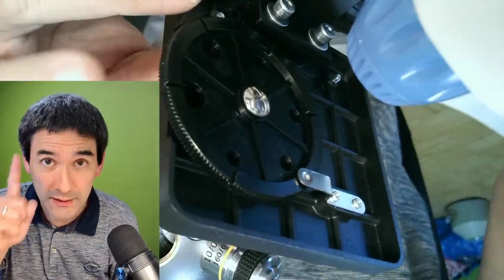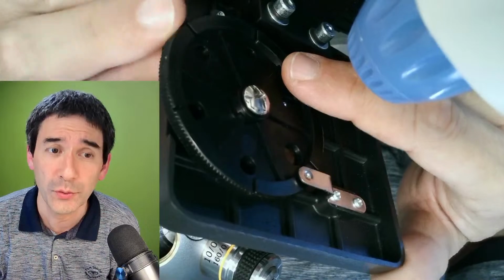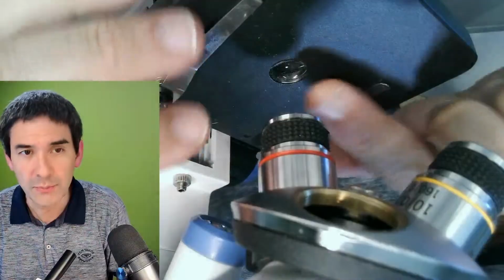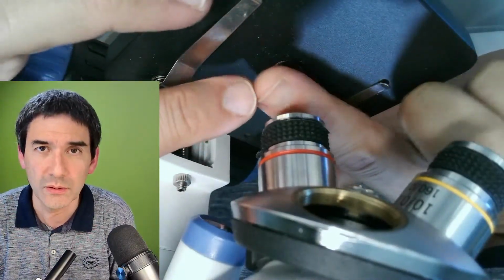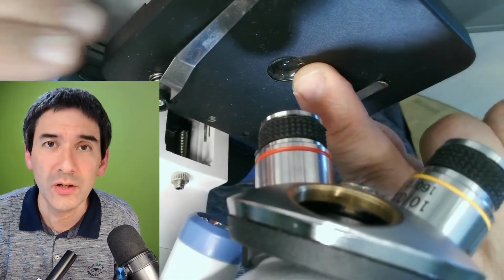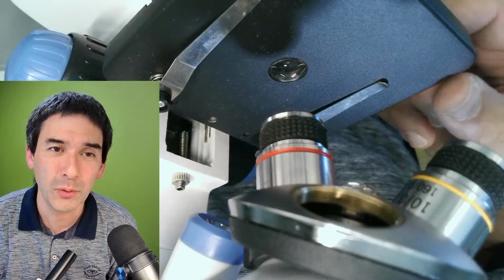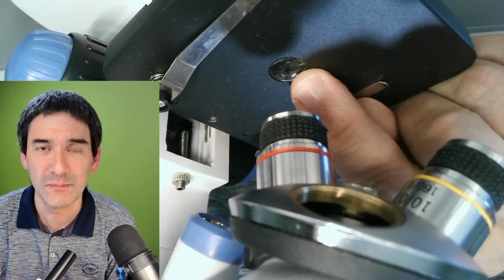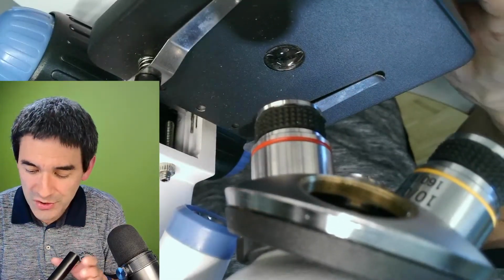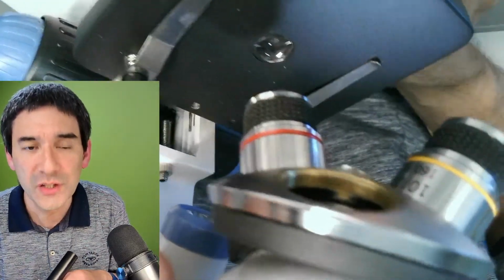What I have now tried in one of those microscopes is, well, why not put some polarizing filters over here on top of those? You put some polarizing film on here, and then you basically have polarized light, and then you can put the specimen on here and the second polarizing filter on top. This does not work because the plastic lens that you have in here starts to depolarize everything again. So you polarize it down here, and then the plastic lens destroys everything again. You see, I've been doing a lot of experimentation with those microscopes, because otherwise they are, let's put it this way, not so bad considering their price.